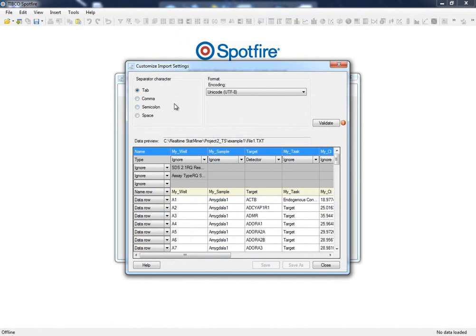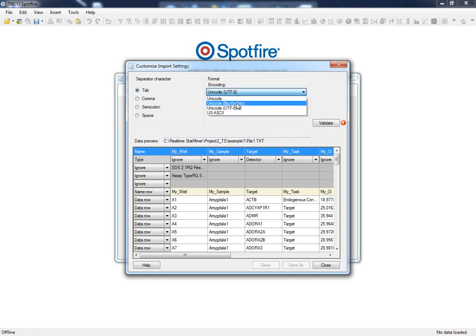On the top, we can define the separator character and the encoding used in our files. StatMiner will automatically try to determine these settings, but we can change them manually in case we are unable to properly display an overview of the data file.